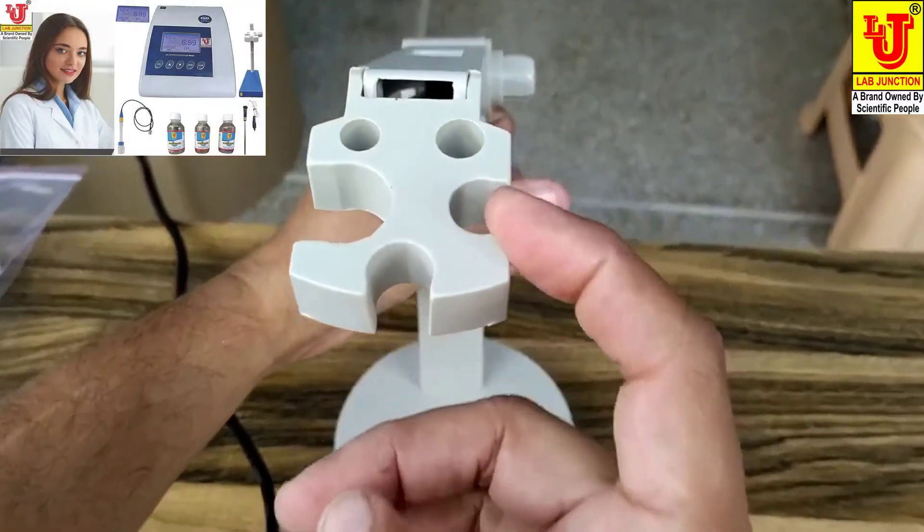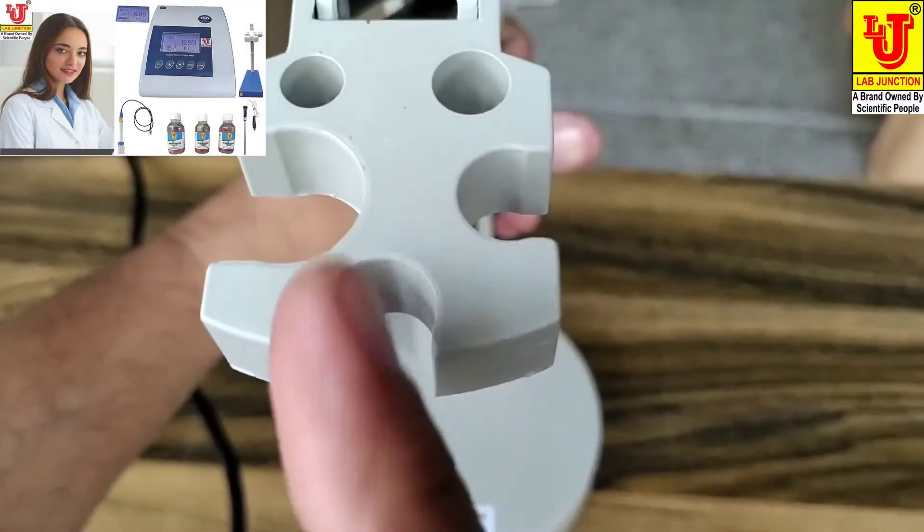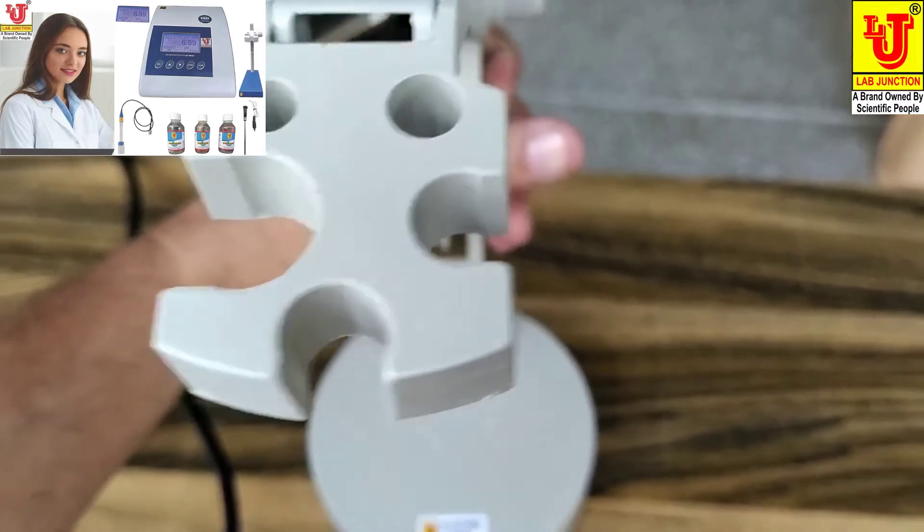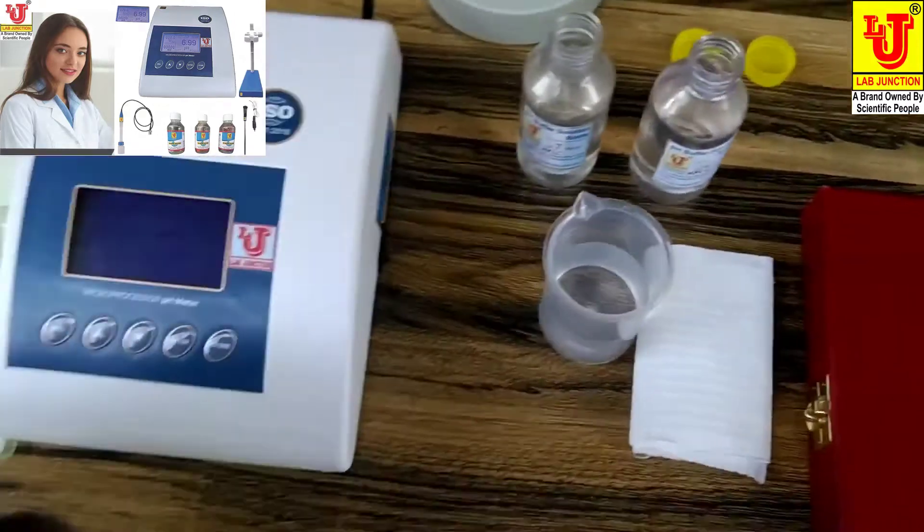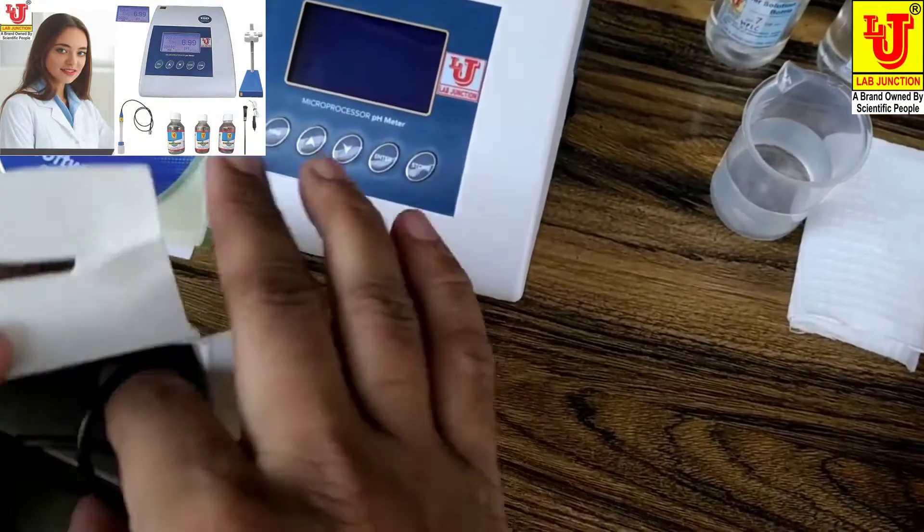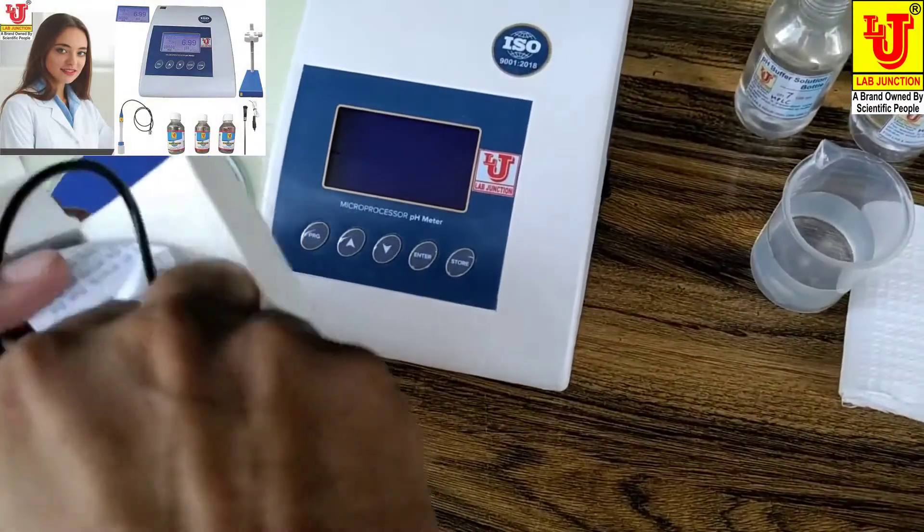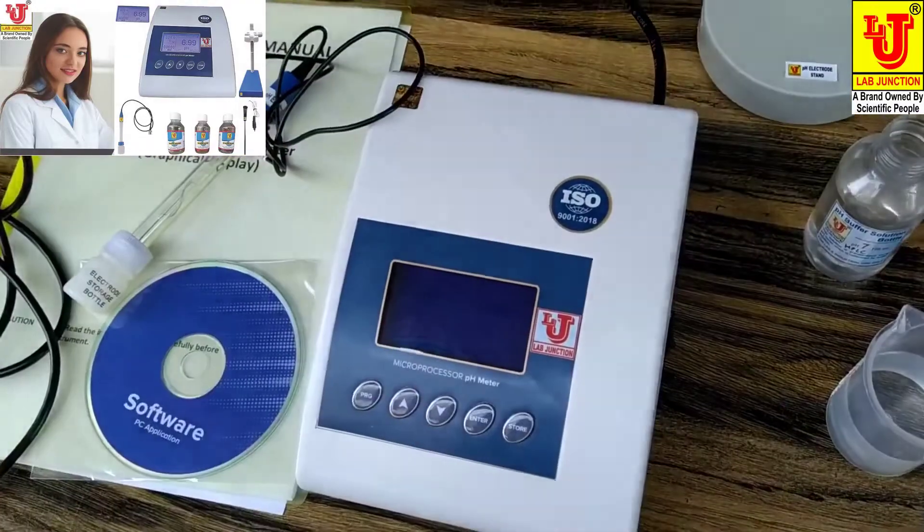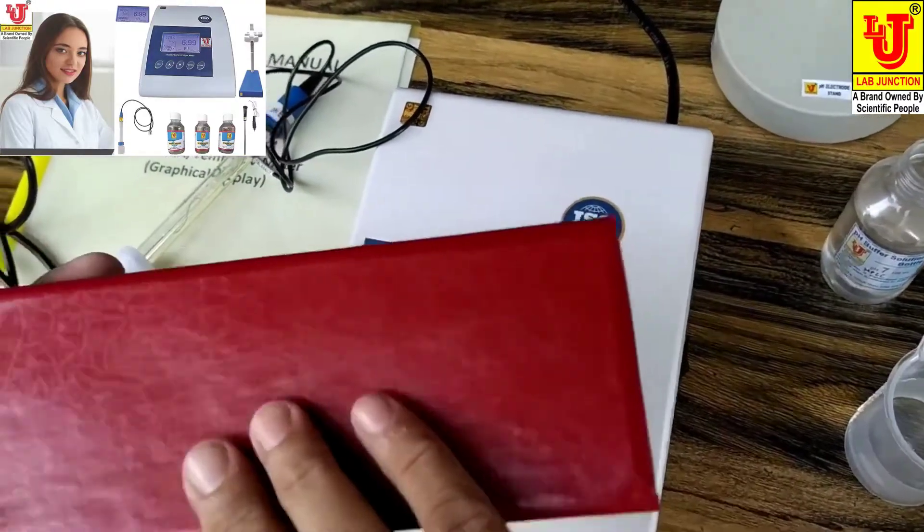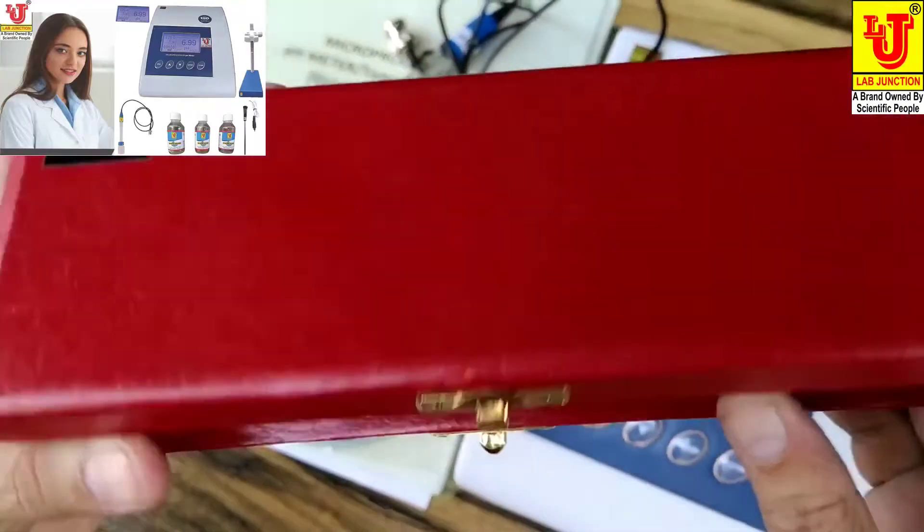This slot is for the temperature sensor, and this slot is for the pH electrode. Now this is the pH electrode. And this is the temperature probe, also you can say temperature sensor.